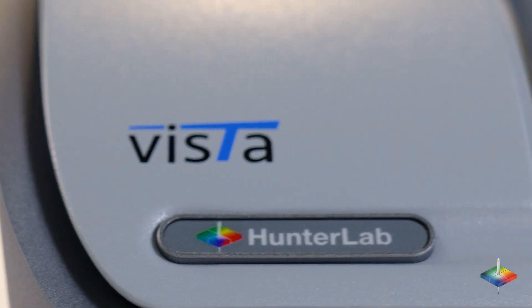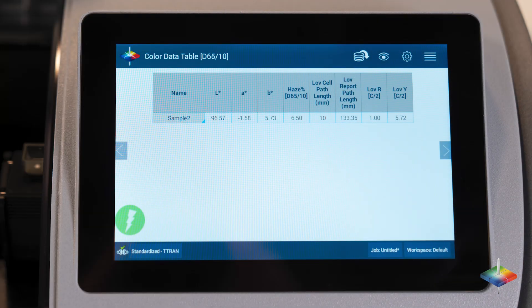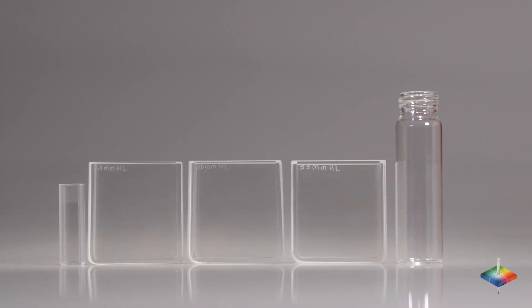Hunter Lab's Vista is the only instrument in the market that can measure color and haze or turbidity simultaneously. The best part? You can measure in any optical quality vial or cell as small as 10 millimeters.